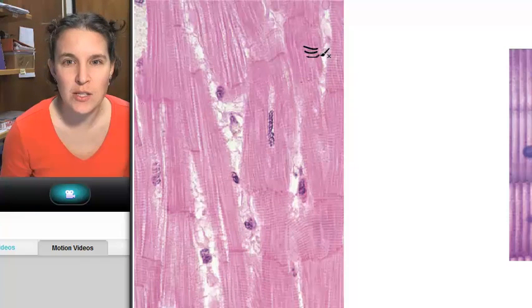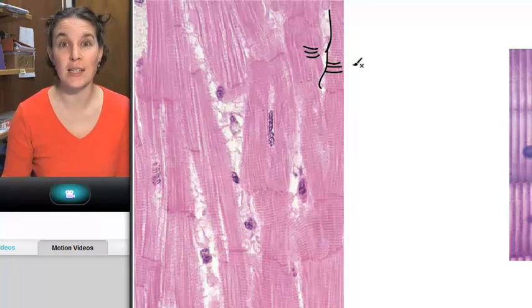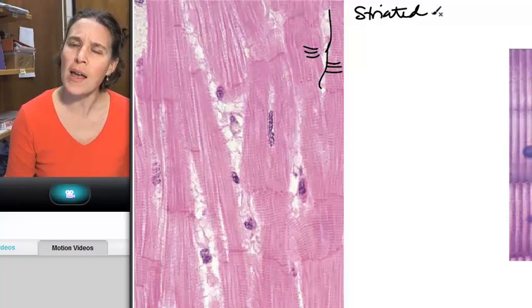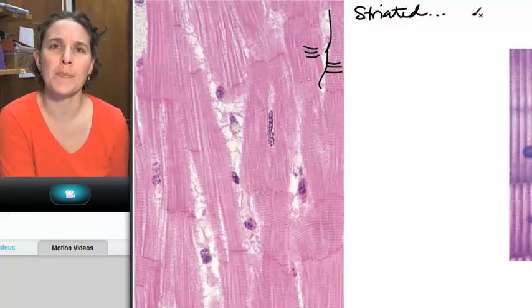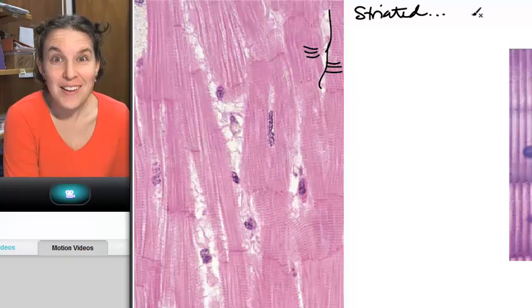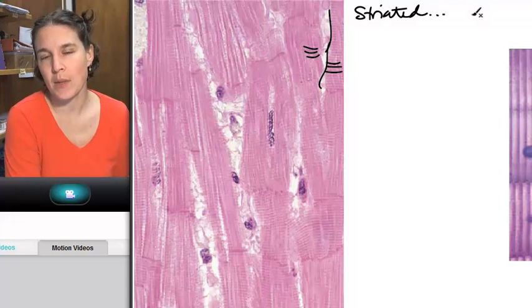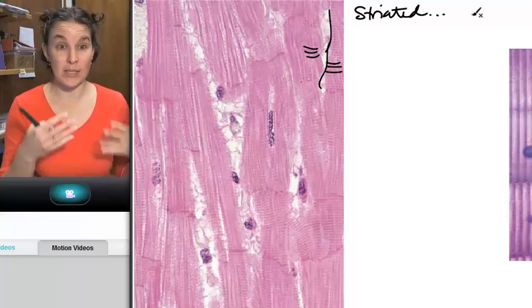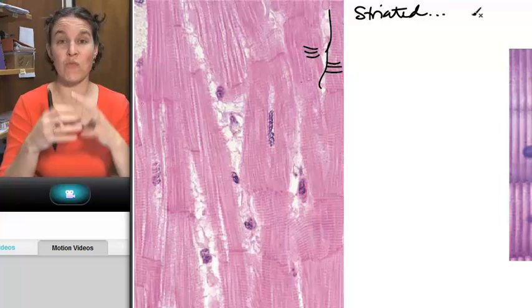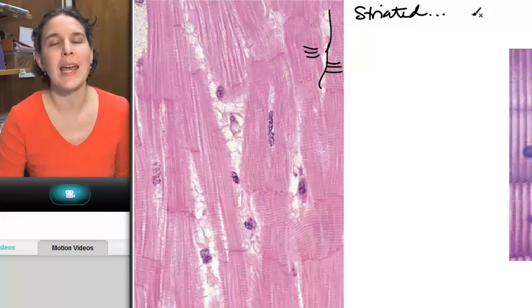Do you see my striations? Do you see these striations right here? Yes, those striations indicate that cardiac muscle tissue is striated. Why was skeletal muscle striated? Answer the question. It was striated because it was made of the myofibrils that were stacked and arranged in sarcomeres, and we could see dark bands and light bands because of that arrangement.